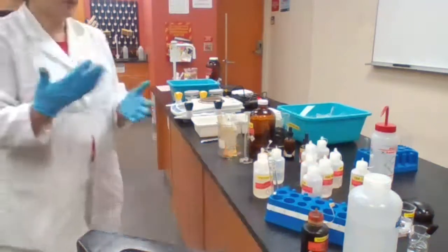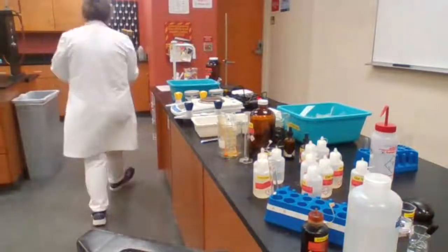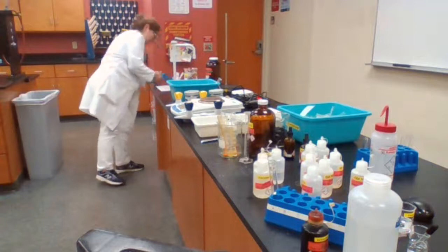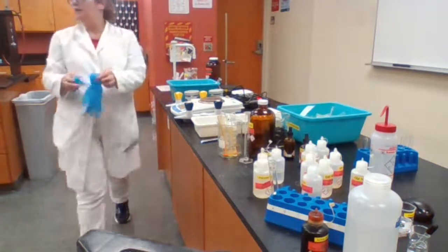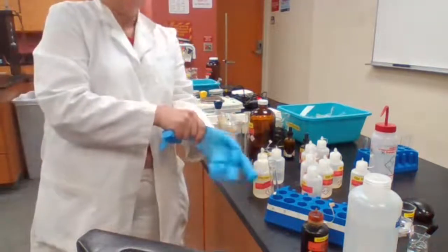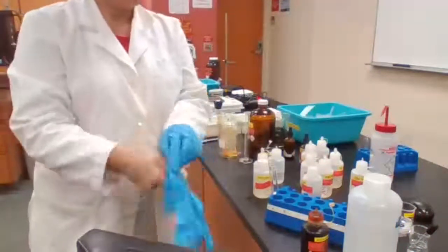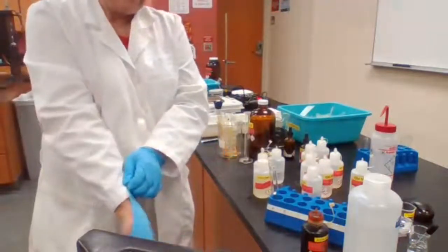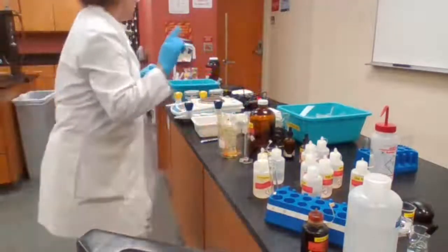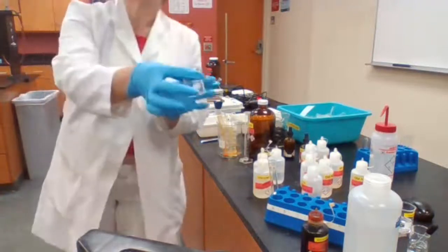Okay, that's part D of the experiment. Just going to go back to part A. For part A of the experiment, it tells you that after the 10 minutes of heat, we are supposed to add it to hot water. So I'm going to put some hot water in a small beaker.